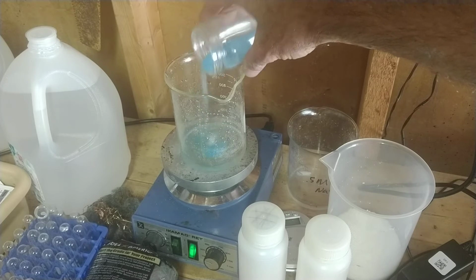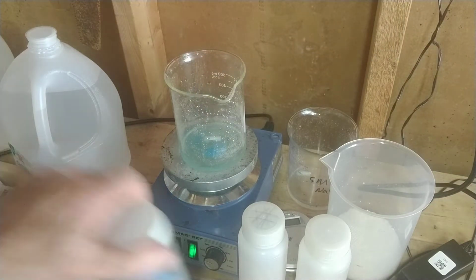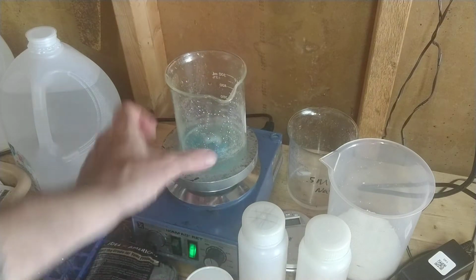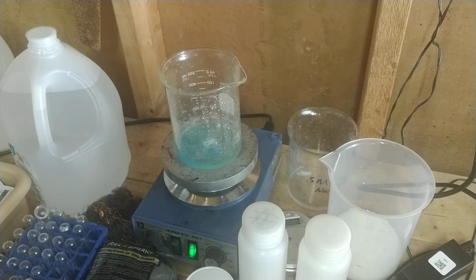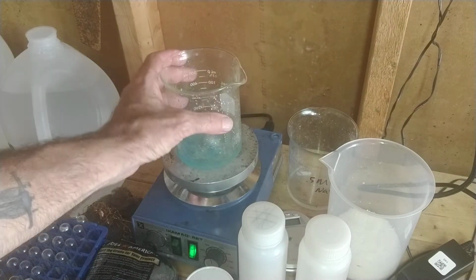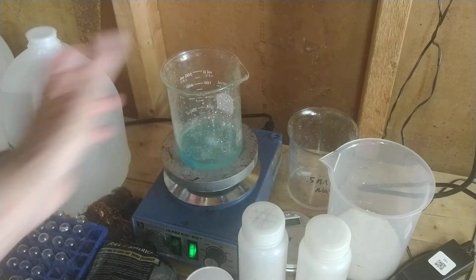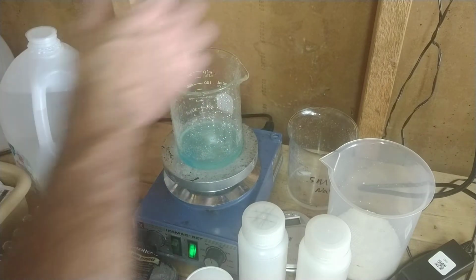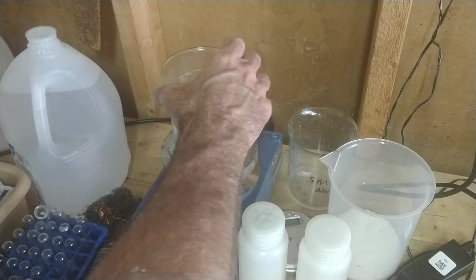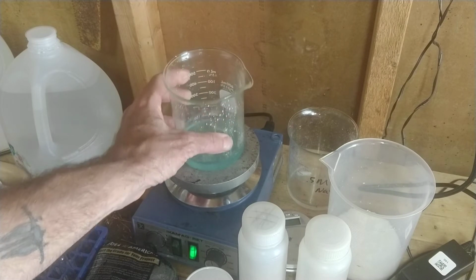There we go. Let that mixer run for a while. Now, mixing, just turned it up. Mixing definitely helps things dissolve faster. At home, you may mix things, you may shake things. Another thing you might do to help something dissolve better would be maybe to heat it up. Right? Shake well.